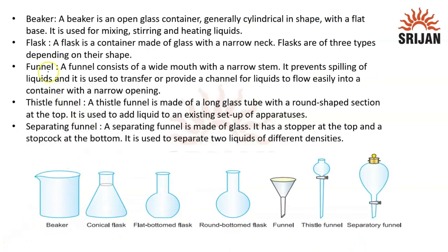Then we have the beaker. A beaker is again an open glass container. It is cylindrical in shape. It has a flat base, and it can be used for mixing, stirring and heating different types of liquids, means experiments can be carried out.